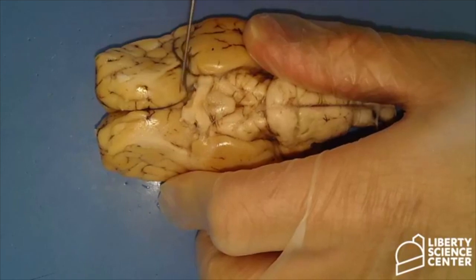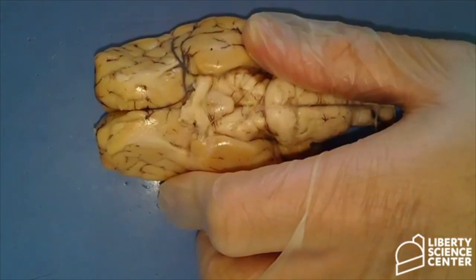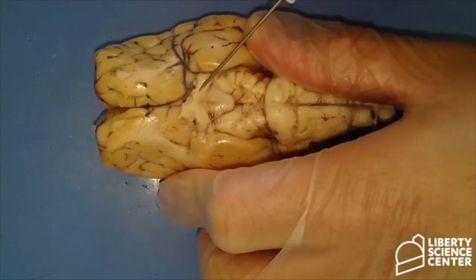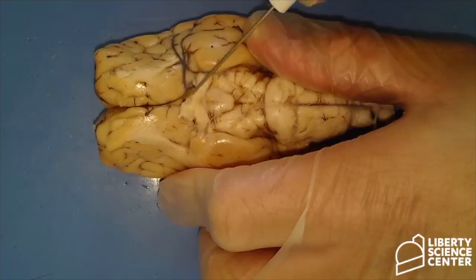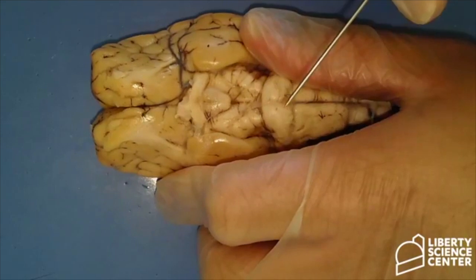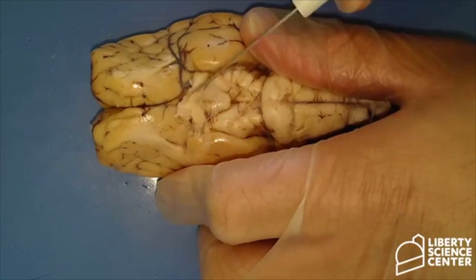If you remember from our cow eye dissection, the optic nerve helps us transmit all that visual information from the eye all the way to the brain. You notice that there is a crisscross that happens here. We have this optic nerve crisscrossing over here, and if we have this nerve here, it would crisscross over here. That point of crossing is called the optic chiasm, and that helps us with binocular vision. This optic chiasm is very pronounced in the sheep compared to humans.